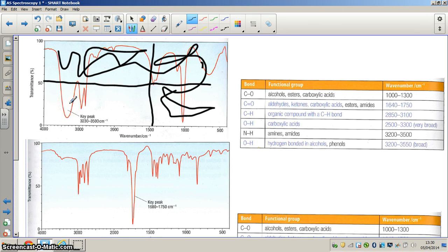That's the only piece of information that we can glean. Now, in an exam question, we might have other information around empirical formula or mass formulae, and other information about chemical tests. But this IR spectrum only shows us that we have an alcohol group in the molecule.